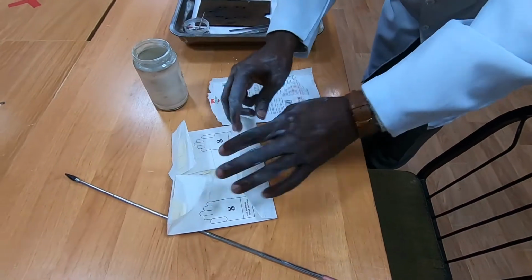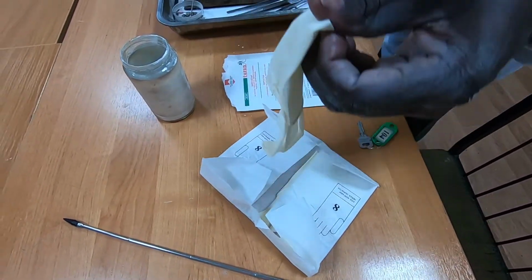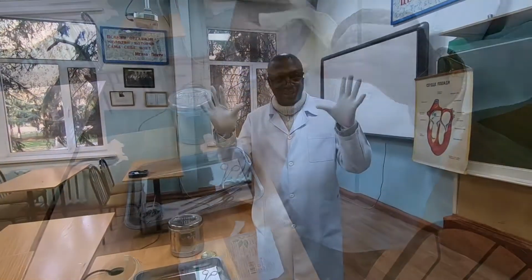So you can see these are our gloves that we're going to use for our work. You can see I have worn my laboratory gloves, okay? And we're going to start our work.